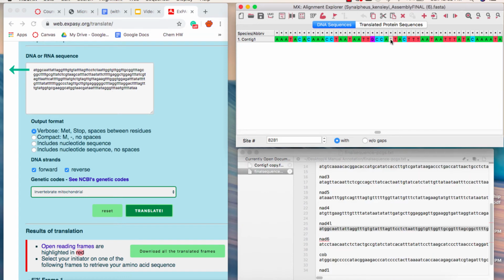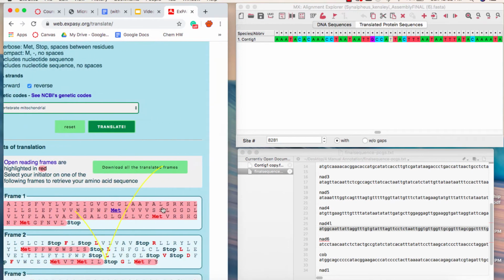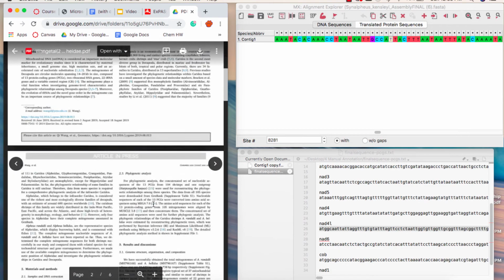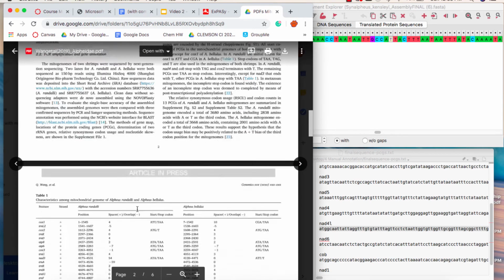Just like with genes in the positive strand, your sequence should have both a start and stop codon. Although there are some exceptions to this rule, which are the genes that have or are presumed to have incomplete stop codons. In this case, you can refer to other literature in order to see if that's a common occurrence reported in other papers.